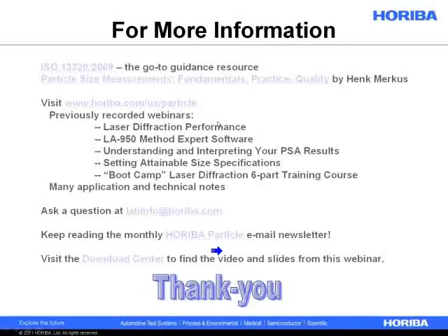This is actually very typical, because a lot of times what you're doing with the ultrasonic is you want to increase your dispersion, improve your dispersion. And what that means is you're taking large agglomerates that may look like they're 5 microns in diameter, and you're dispersing them into 1 micron primary particles. And even though a 5 micron particle will scatter more light than a 1 micron particle, it's not that you're creating one 1 micron particle from one 5 micron particle. You're creating many small particles, and collectively they will scatter more light than the one 5 micron particle.